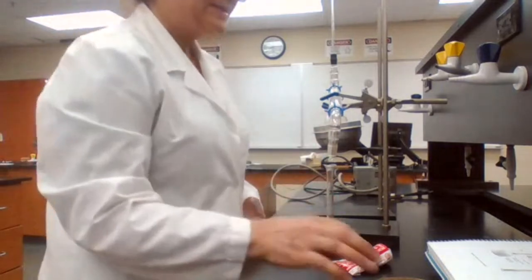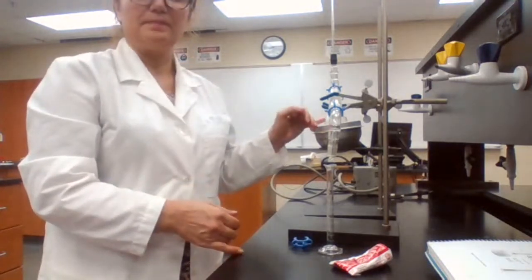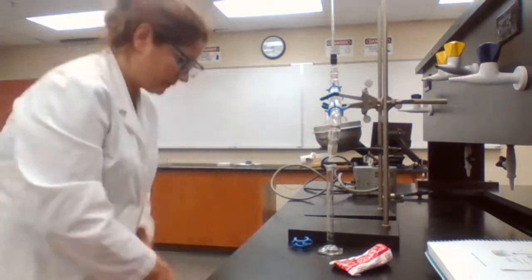Okay, a simple distillation is already set up. Going to look for your questions. Do you have any questions? If you have any questions, please type your questions, and then I will get the sample into the flask, start distillation.